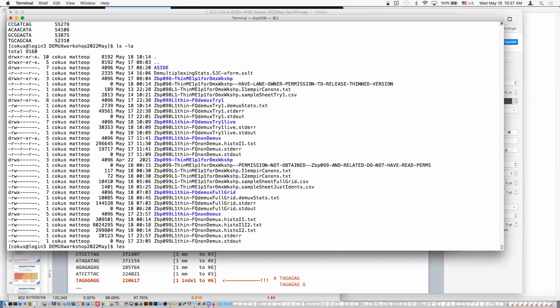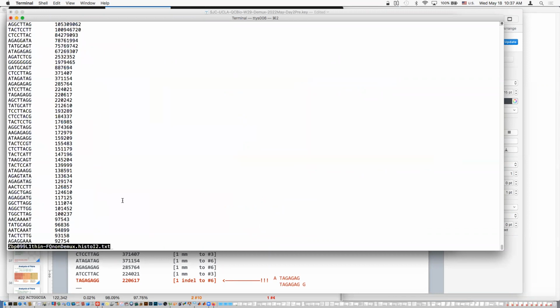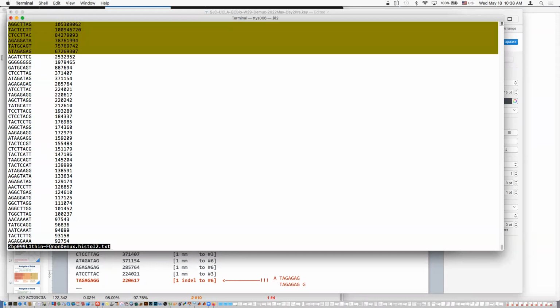I'll do a third example. You can see you can do these pretty fast once you're into it. So there's the I2 top. And I told you in I2 we're only expecting 6 from the user, right? Each one should be used twice, so you'll see here that the representation counts are higher. There's really 2 guys each. So okay, 1, 2, 3, 4, 5, 6. I'm cheating because I'm not supposed to know that there's really 6, but clearly there's a big break there.